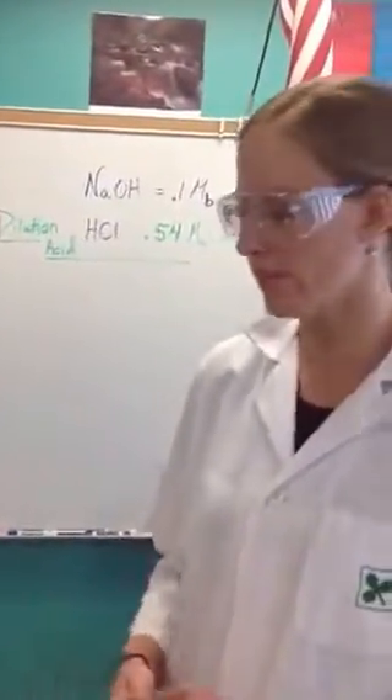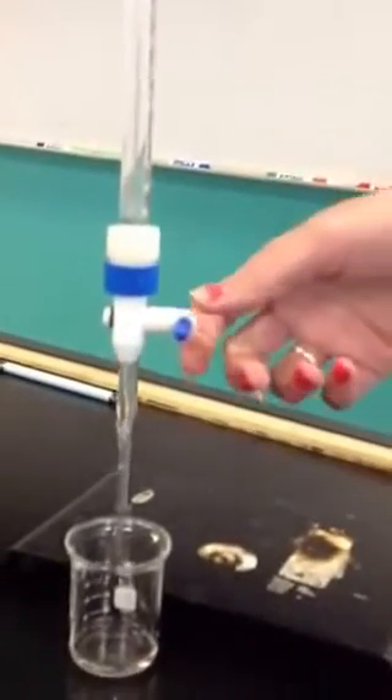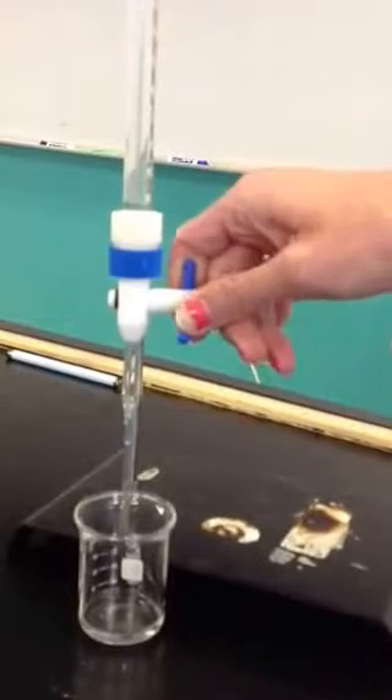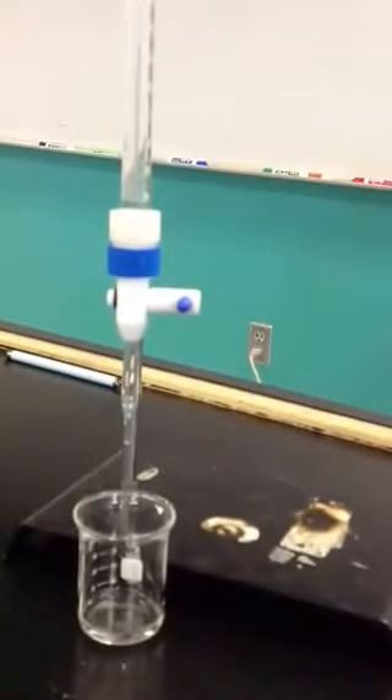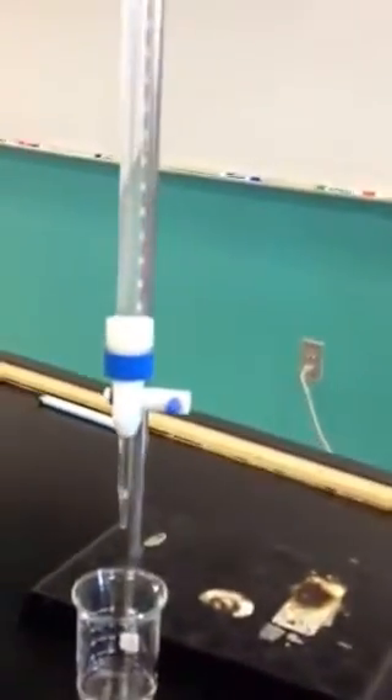The other thing you want to do when you start is check to make sure there are no bubbles in the burette. For example, this burette has a huge bubble right there. What I would do to fix that — before you even take a data point — is just open your burette so that the bubble comes out. If you don't do that, it would count as a human error and you would have to start over.